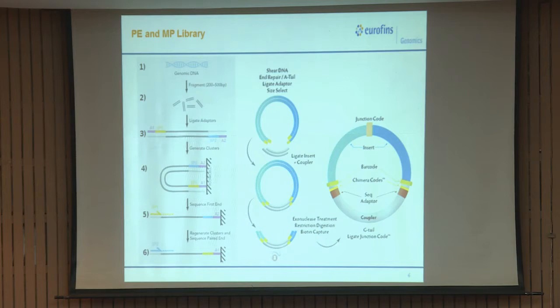Now, for mate pair, we have a circular region. How we make it a bigger distance between? So, we have a longer distance in mate pair to resolve the repetitive regions and to resolve the ambiguity in the genome. So, if I have long gaps in the genome, if I have long repetitive regions in the genome, we use these type of libraries in which it is a circular library, right. This is also sequenced and it also has a different thing, it is a circular library and it has a junction sequence.